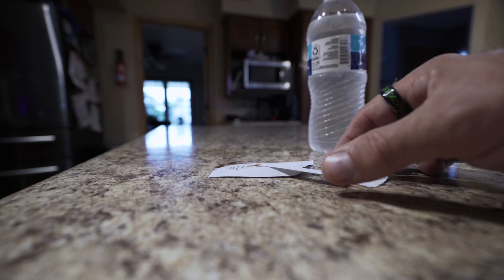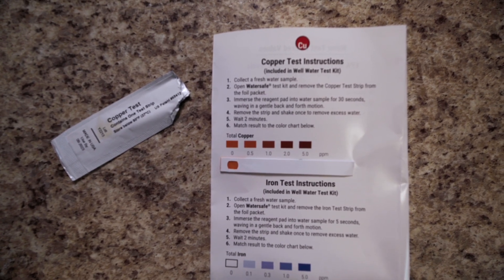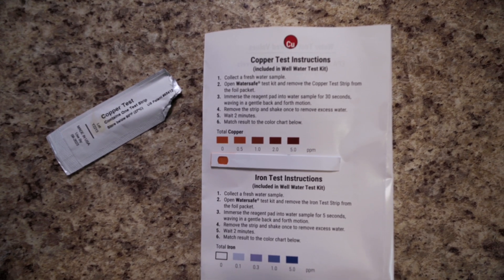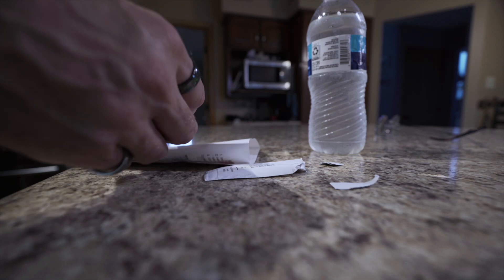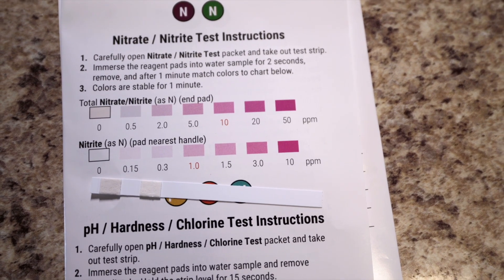It's been about two minutes, so we're going to read the results on this copper test. All we're going to do is match it up to the picture in the instruction book. It looks pretty light, so I'd say it's the lightest one — there is zero total copper in this water according to this test.